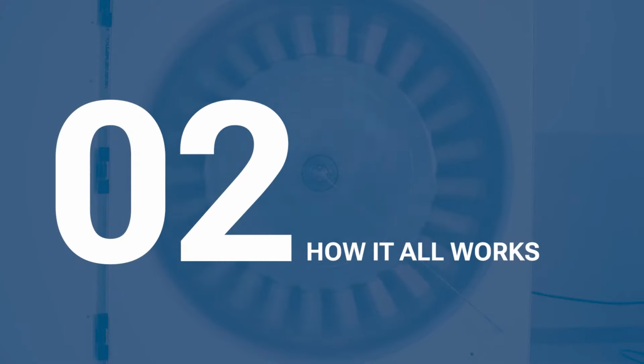The separation begins in ascending mode, where we pump the upper phase into the rotor's inlet. Because compound A has a lower KD value, it moves through the system faster. We can collect a small, pure portion of compound A during this phase. However, once compound B reaches the rotor's outlet, we switch the valve to pump the lower phase in the opposite direction. This pushes the partially separated mixture of A and B back into the system.